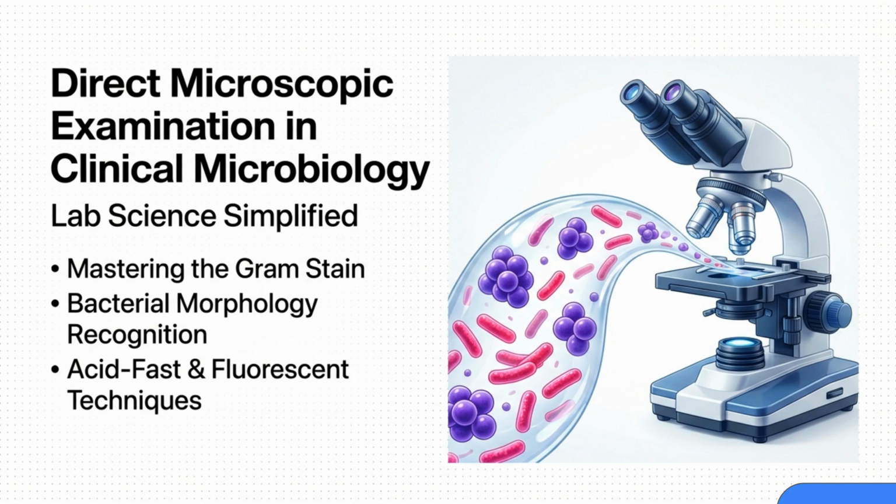Welcome to this video on Direct Microscopic Examination in Clinical Microbiology. We will cover mastering the gram stain, recognizing bacterial morphology, and understanding acid-fast and fluorescent techniques, simplifying lab science.